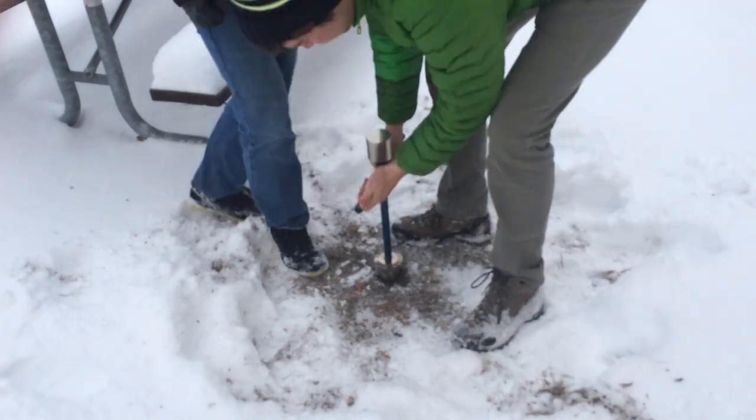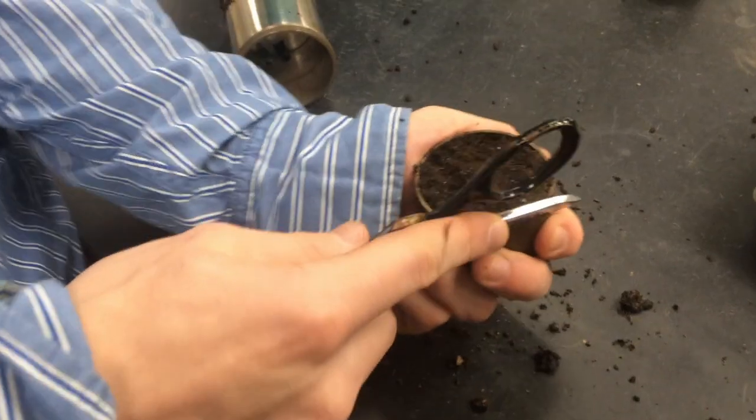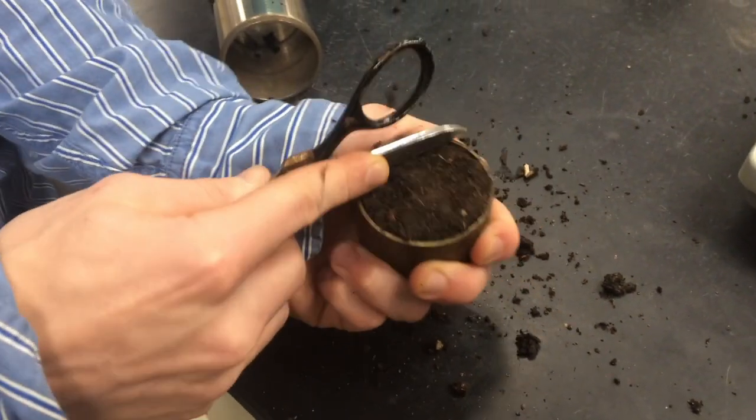After the core has been collected, remove a soil filled ring from the core sampler and use a knife to flatten the edges.